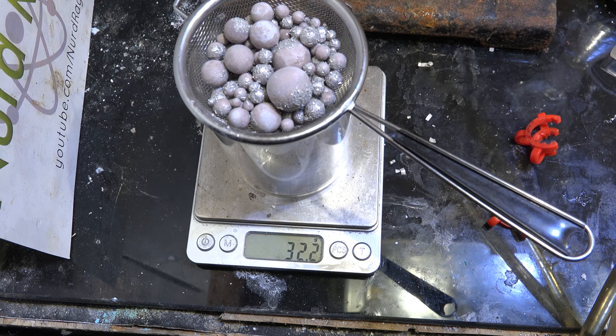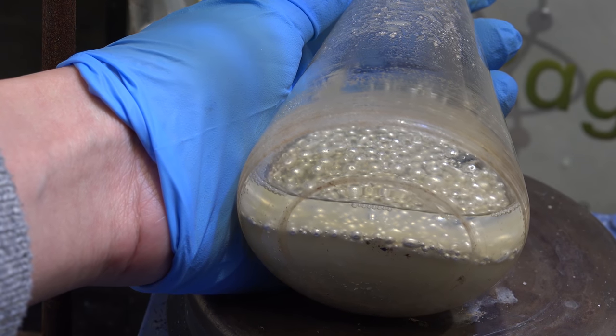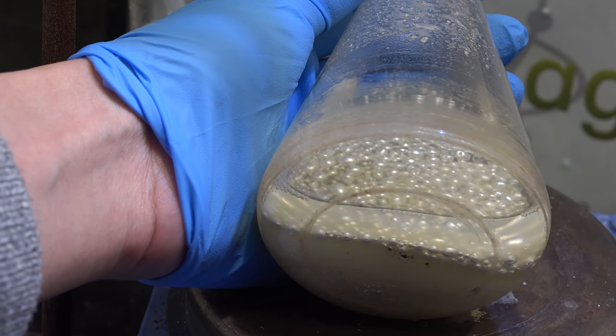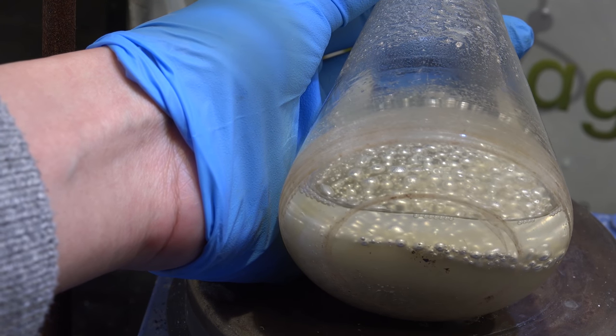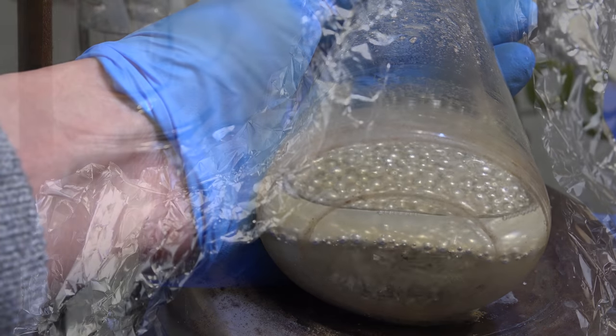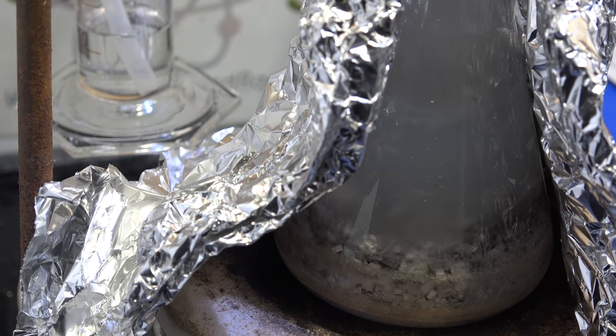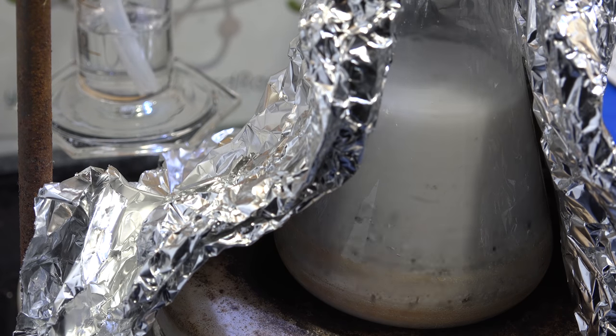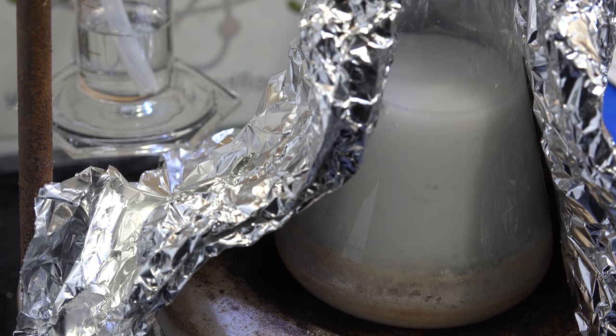I've been able to refine the techniques for recovering sodium and I've also been able to solve the troublesome glassware destruction problem. Basically I had to dry the sodium hydroxide with sodium metal. Overall things look pretty good. Now it's just an optional matter of exploring the chemistry a bit more and maybe find a few more ways to streamline and optimize the process.